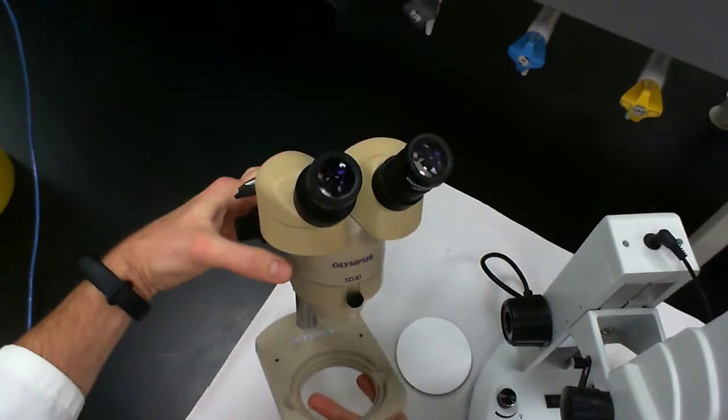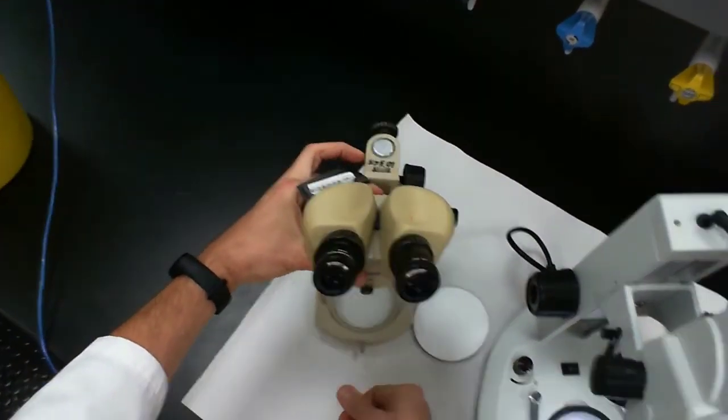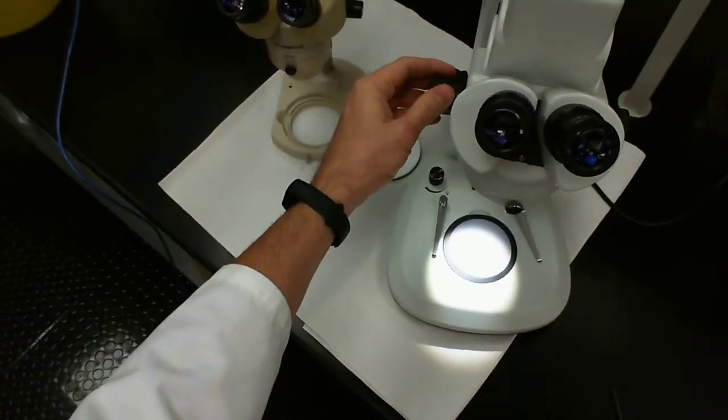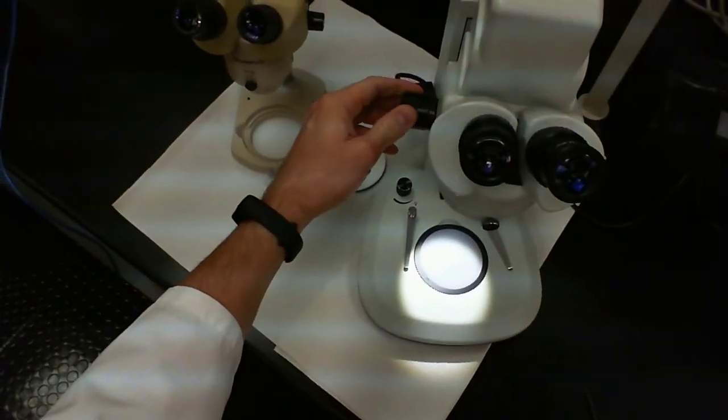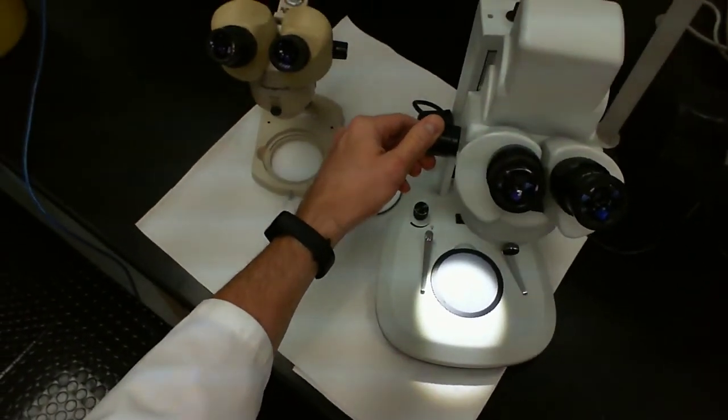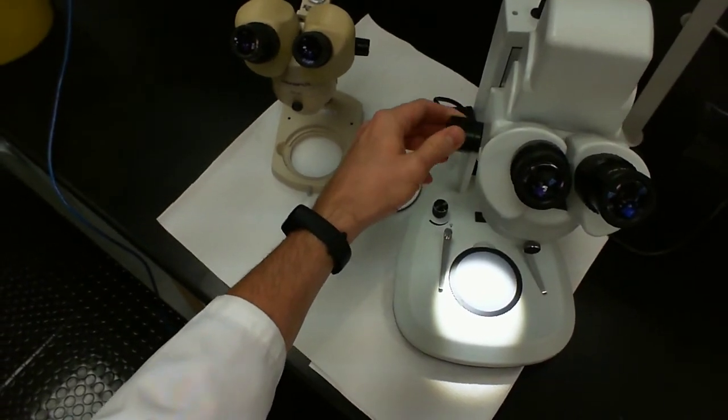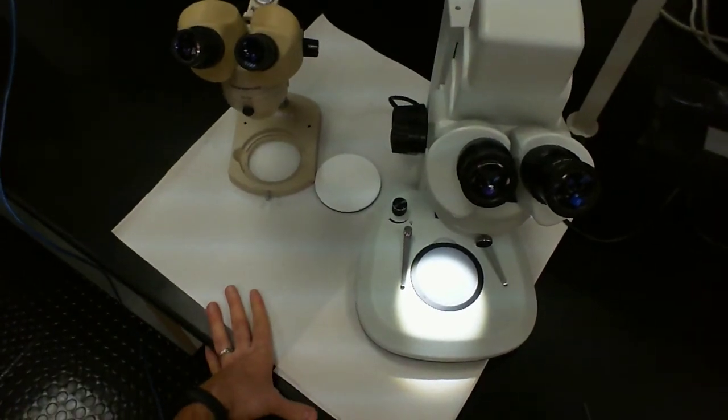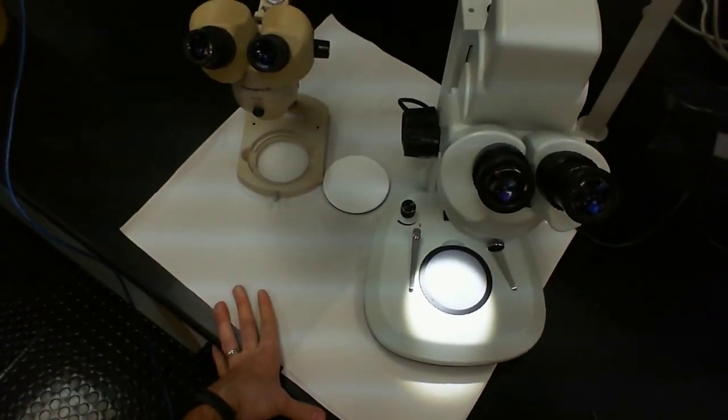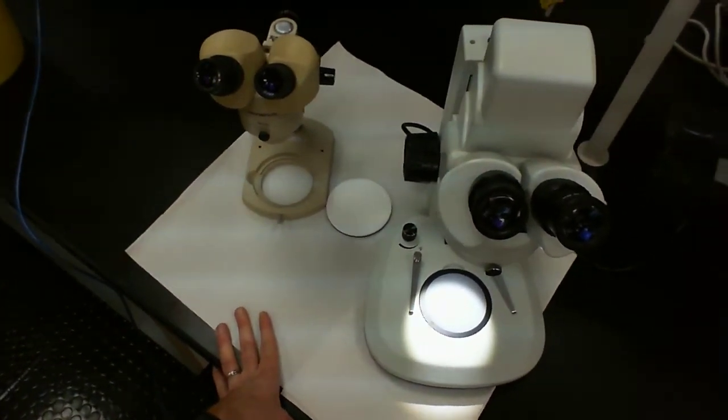The newer microscope has a more fancy system of lenses in place where you have a continuous change in magnification. As you turn this, you can increase or decrease your magnification as you wish. But again, magnification here is not very high with stereo microscopes compared to a compound light microscope.